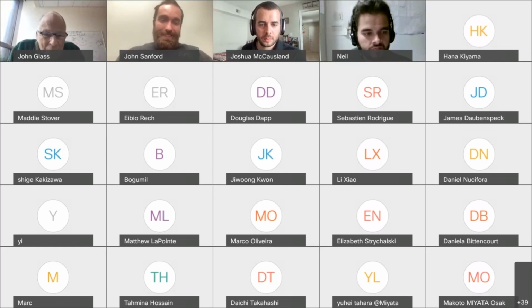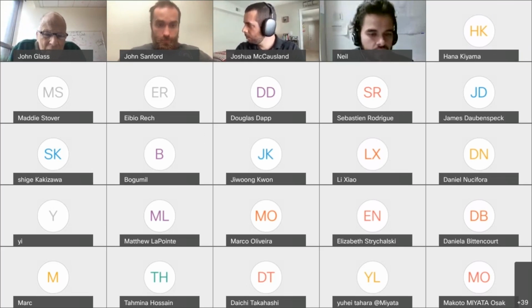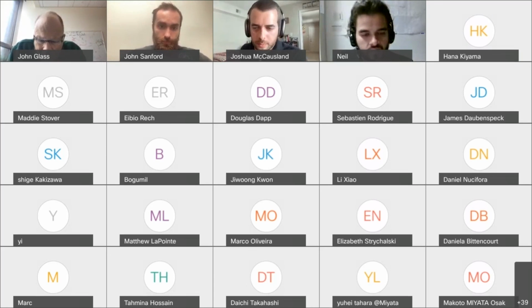Give me a minute. You might try really low concentrations of non-ionic detergents. Tween 20 comes to mind. I mean, really low level concentrations, like 0.01% or something, after sonication, to get them to exist as a single cell for a little while and function. It's really helpful, at least to consider and look into.